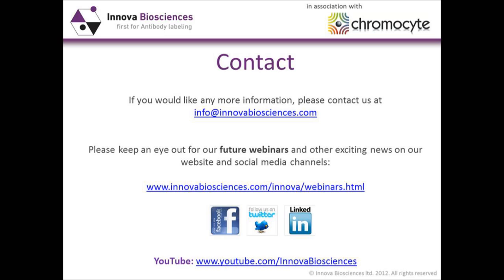Okay, we also, yep, go ahead, Andy. Okay, thanks, Graham. There was a question from Erin regarding the Lightning-Link times moving from 3 hours to 20 minutes, or the kits that I mentioned in relation to that. The standard Lightning-Link kits have that 3-hour incubation time.